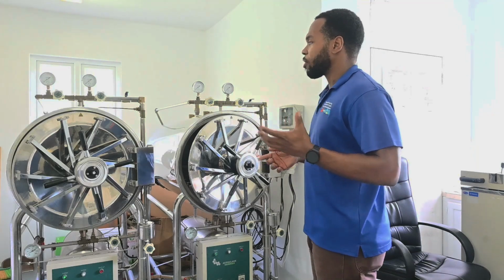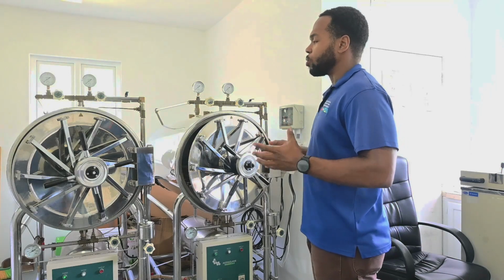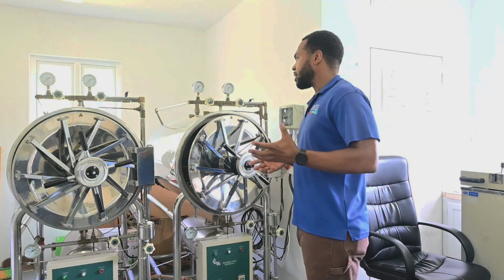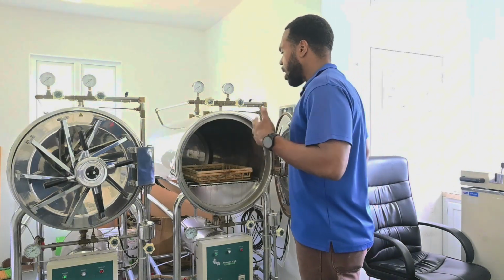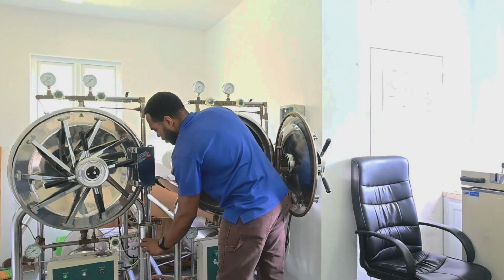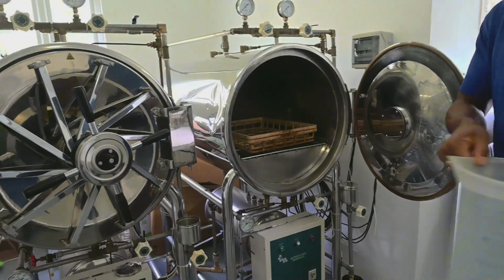It turns the media from a liquid to a semi-solid, and the agar needs to be boiled or heated at high temperatures to allow it to dissolve and be uniform in the contents of the medium for it to solidify at the end. So the first thing that we have to do is to add water to the autoclave. It is filled here. We open the valve on the filling cup and we add distilled water to it.